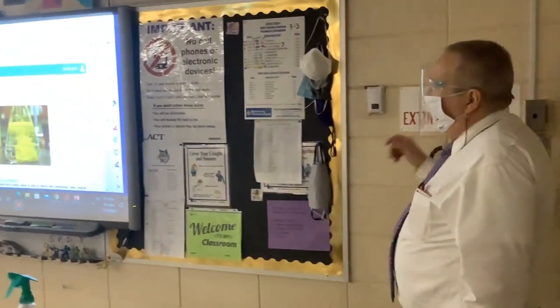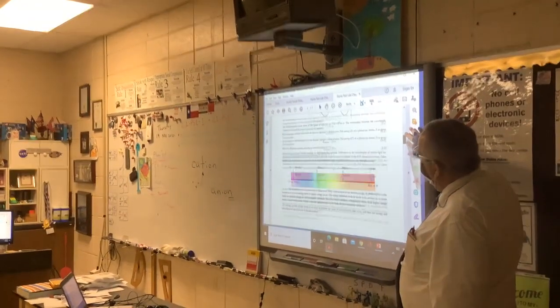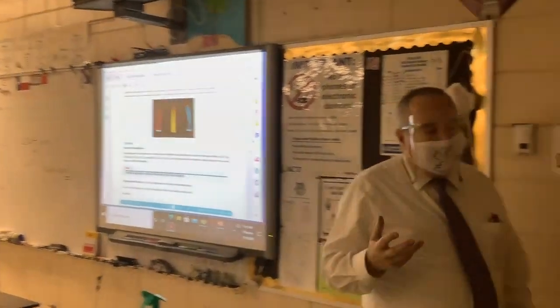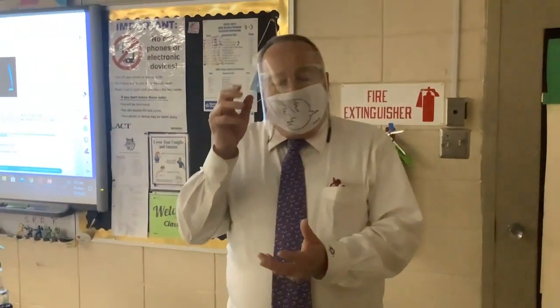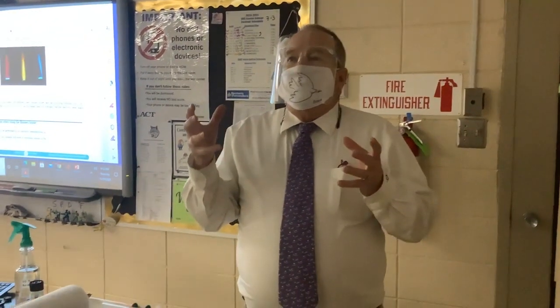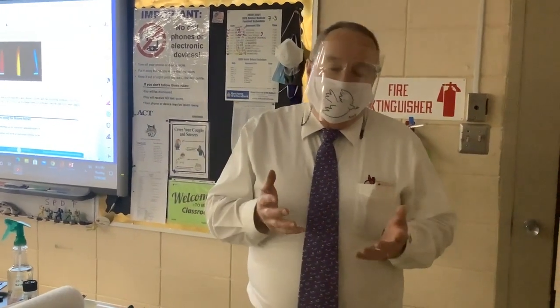I'm going to turn the lights on. We'll get through this posted flame test procedure. There's two parts to our lab today. We're going to do flame tests. We're going to excite atoms, raise those electrons to a higher energy level by putting a solution of some of these chemicals into a flame, and they will glow or burn or give off a specific color.